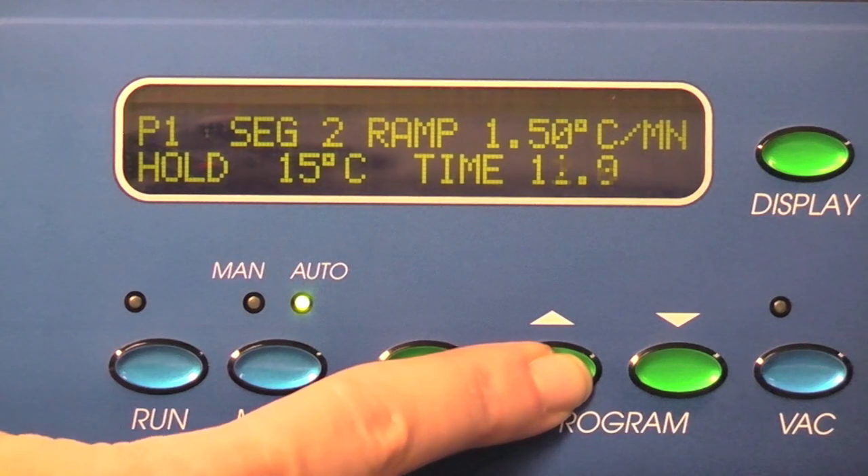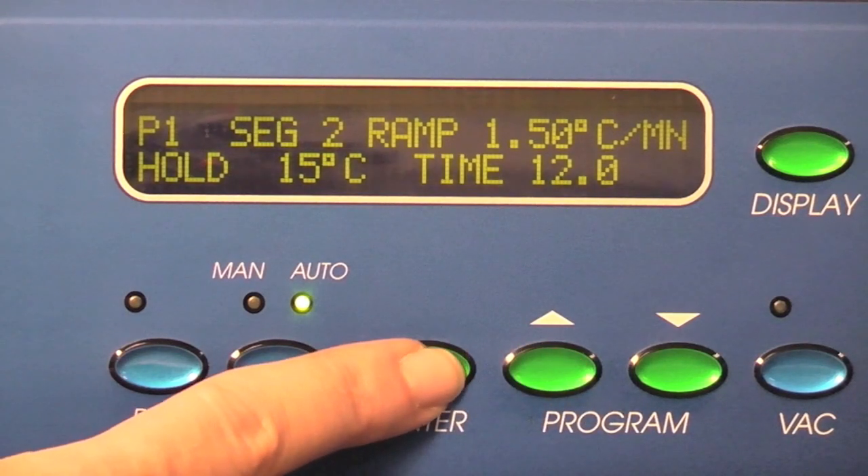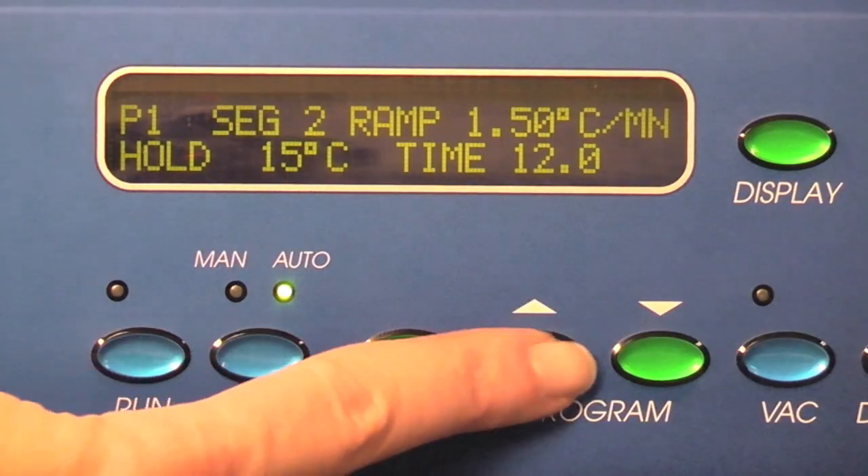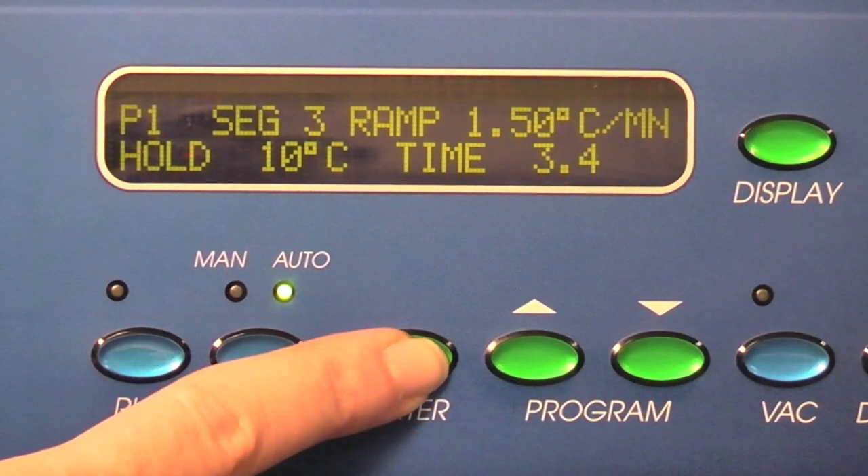Press enter to store the parameters and advance the cursor until SEG is blinking. For SEG 3, 4, and 5, we will set the time to 0.